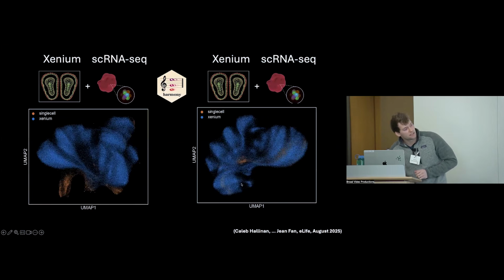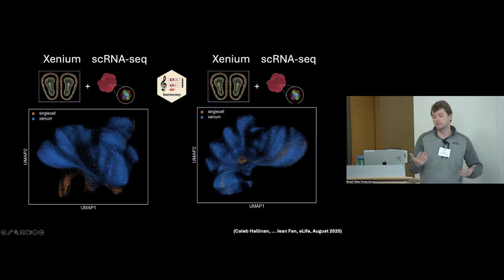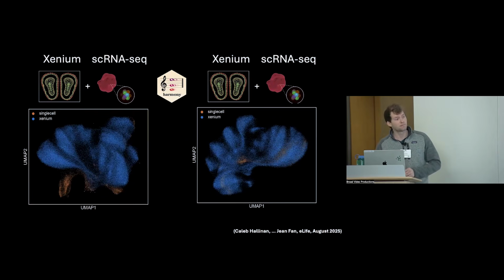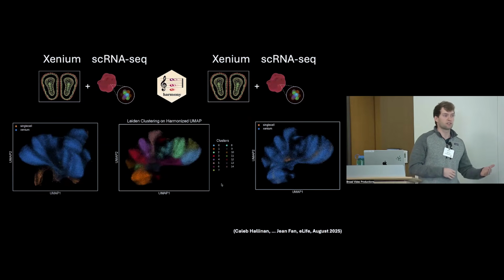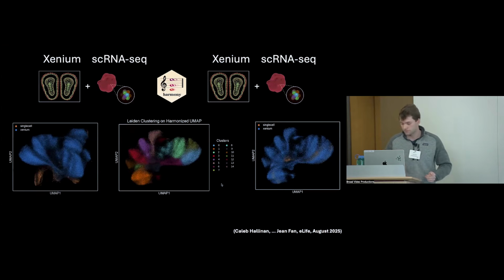Ideally, cells in this area have very similar molecular profiles and are the same or similar cell type. We also cluster this UMAP, and the quantitative analysis you'll see for this uses clusters rather than patch-based level expression.